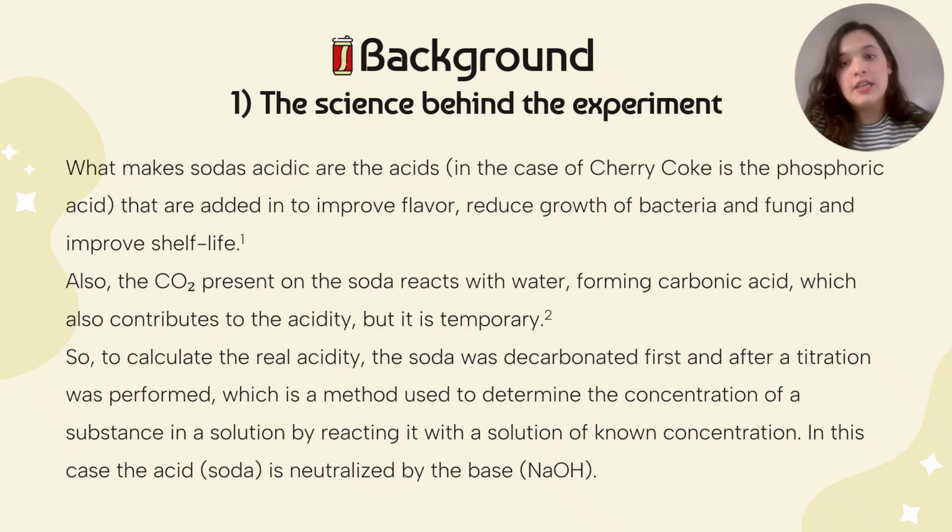Another thing is the carbon dioxide present in the soda that reacts with water, and this reaction forms carbonic acid, which is another type of acid present in the soda and also contributes to acidity, but it's temporary. Because of this, we want to calculate the real acidity in the experiment. So the soda was decarbonated first, and after that a titration was performed.